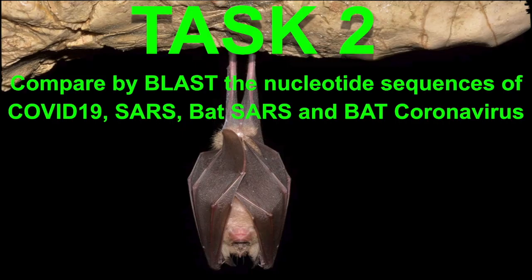Now, on to task two. We're going to be comparing, using BLAST again, the nucleotide sequences of COVID-19, SARS, Bat-SARS, as well as Bat-Coronavirus.